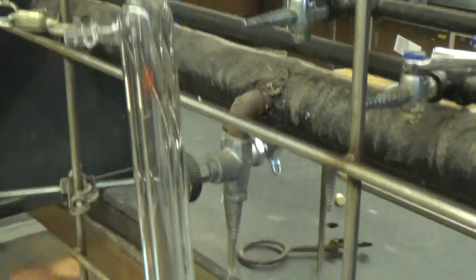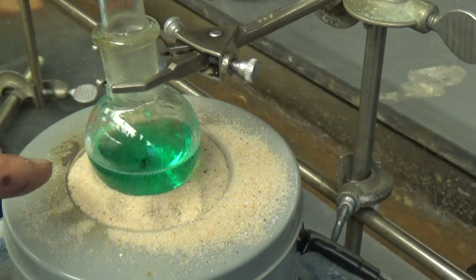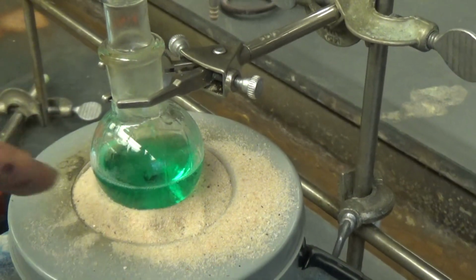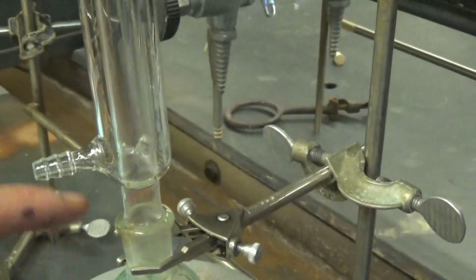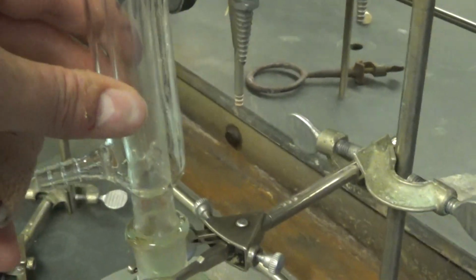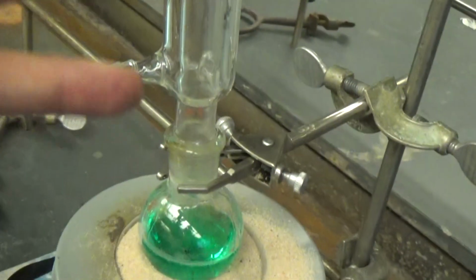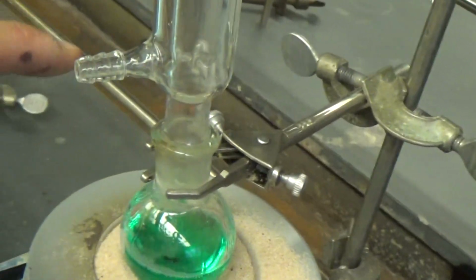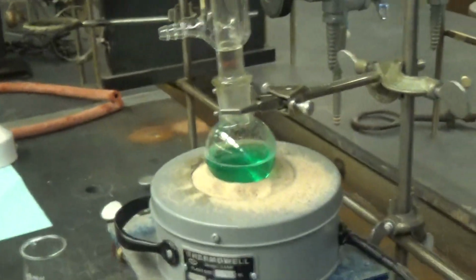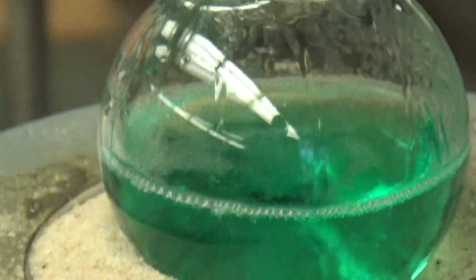We're not too worried, since it's acetic acid in there, about it boiling away. It'll climb up, and it's still pretty cool up here, so it doesn't escape. If this was really boiling and climbing up, then you'd flow some cold water in there. Anyway, that's pretty fun to look at.